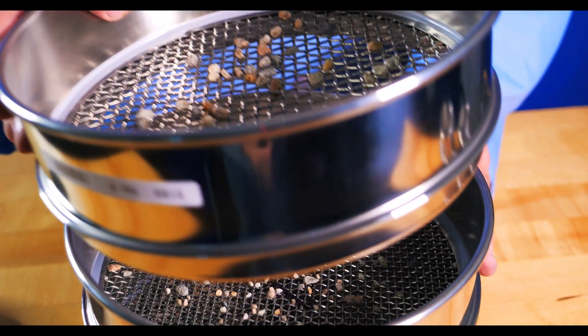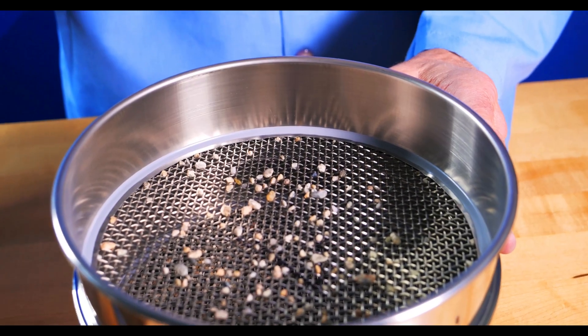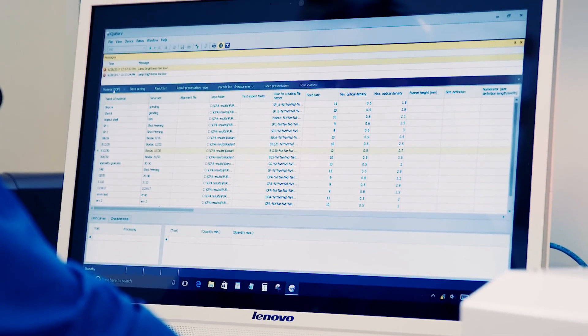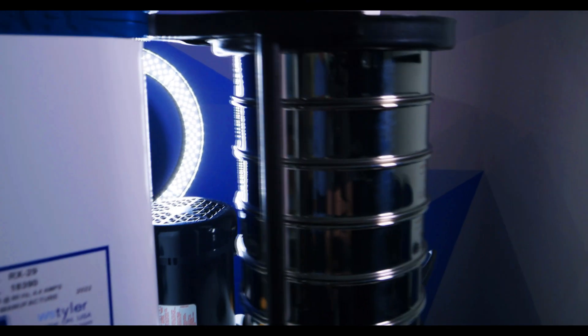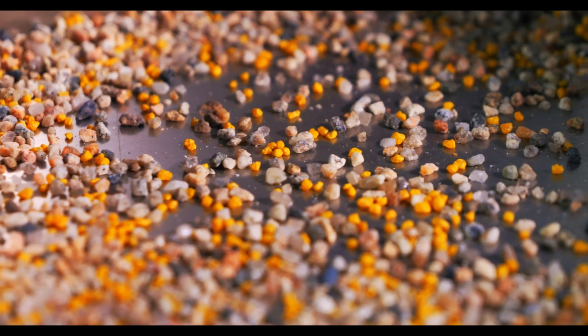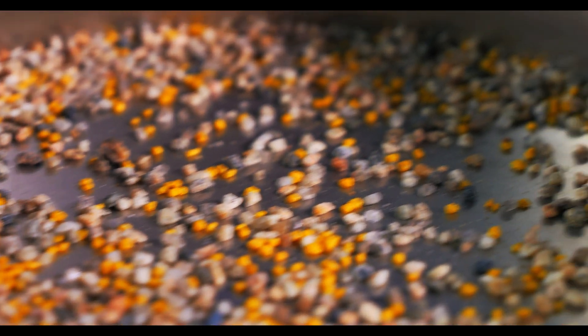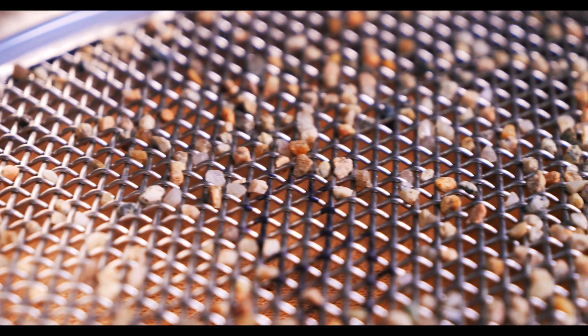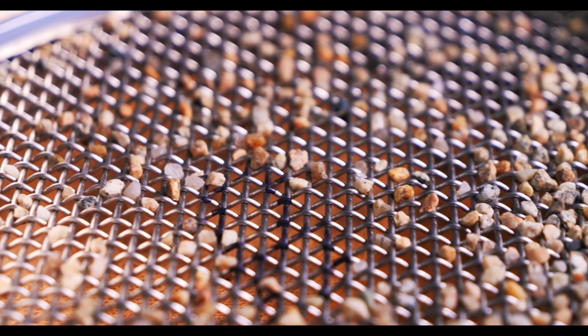Remove the sieve stack from the shaker and weigh each sieve individually without removing the material. Record the weight of each sieve, put the sieve stack back on the sieve shaker and run the material for an additional minute. Remove the sieve stack and weigh each sieve individually and record the weight. If 0.1 gram or more material passed through one sieve to another, repeat the last steps until there's less than 0.1 gram of material passing between the sieves.